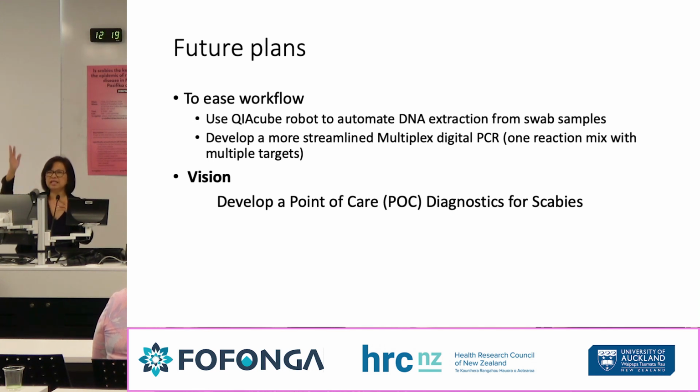So the current target that we detect has a green fluorescent dye. I can put the SSR5 in red, I can put the other one in orange. So it's all colorful out there. But my biggest vision, though I don't know if that will still catch up before I put the curtain down or retire. Can I retire?